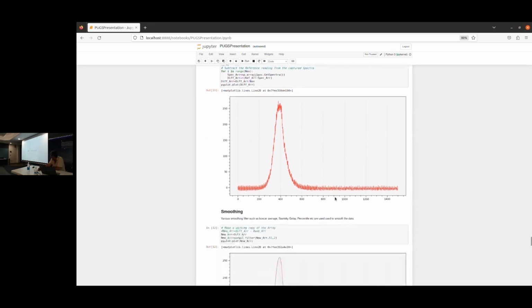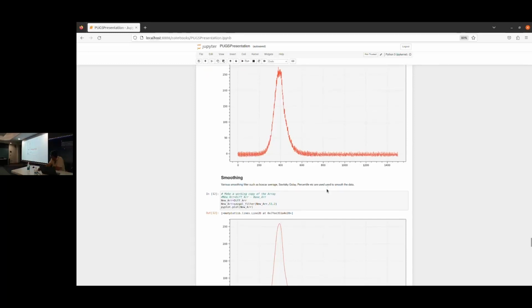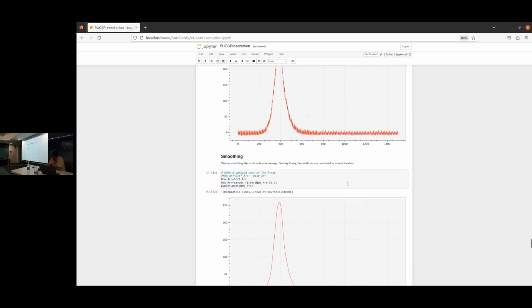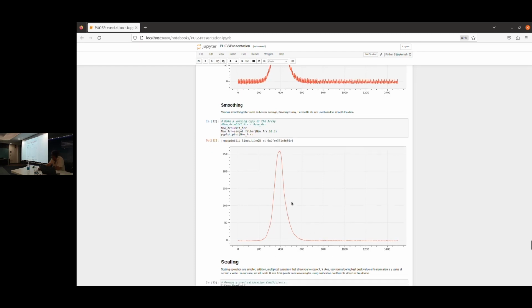You typically, first thing that you do is run some smoothing functions. There are many kinds of smoothing filters available. You can have Savitzky-Golay filter, percentile filter, simple convolution filters, rectangular, triangular. You can try what works best for you. You get a smooth looking waveform. Hopefully your filter has not degraded the amplitude or introduced distortions of other kind.